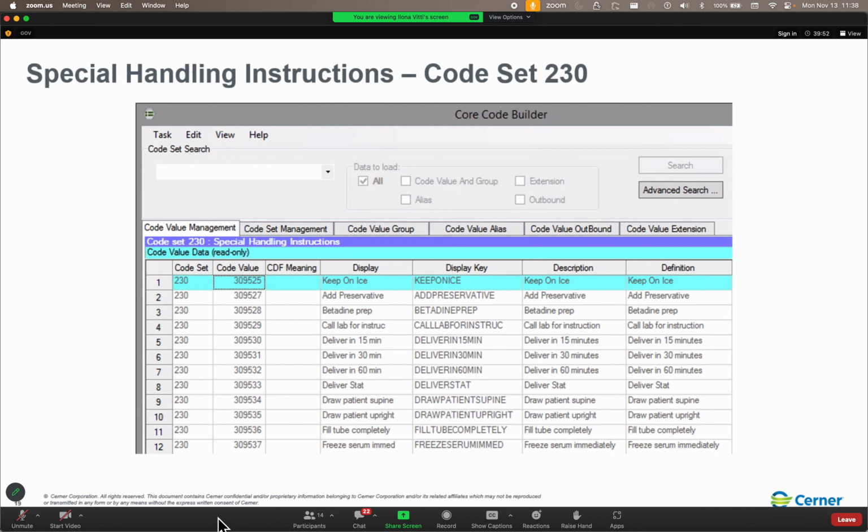And now I am going to go ahead and go through the activity validation with you. And I'm going to introduce you to a really good tool for reviewing your build, and that's Collection Requirements Inquiry. The tool with the longest name in lab, I think. So let's open Collection Requirements Inquiry and sign on in.